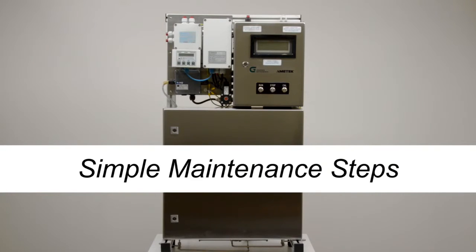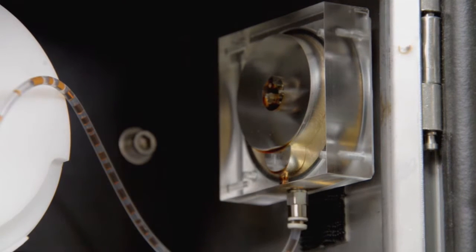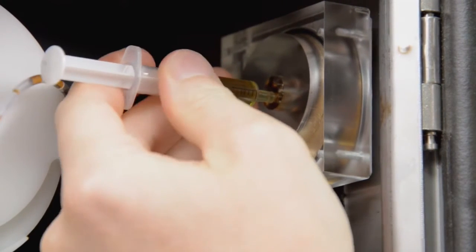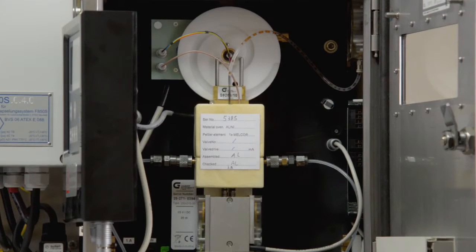Simple maintenance steps. Check the oil lubrication reservoir every 10,000 runs. The bottom chamber of the reservoir should be filled with oil. If it is not completely filled, fill 0.5 to 1 milliliter of oil into the reservoir. You may exchange cells between different analyzers. No calibration is required on a new cell.